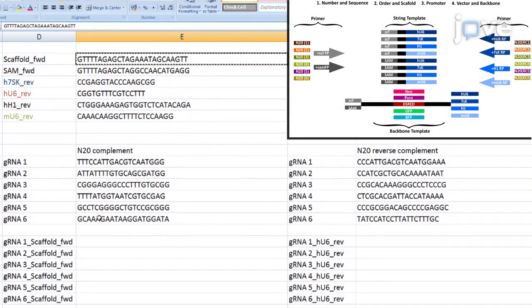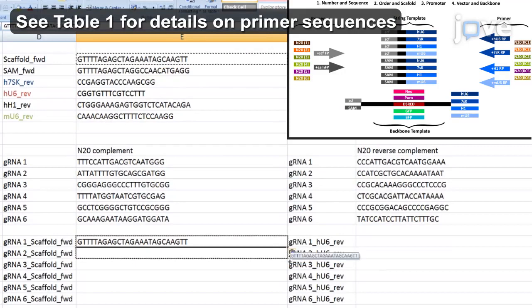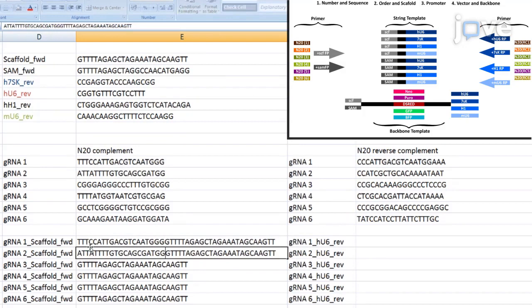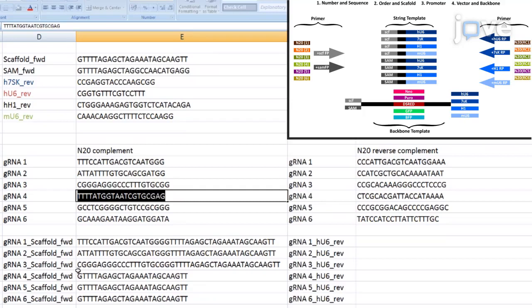To begin, add the n20 gRNA sequences to the forward amplification primers for staggered DNA string as overhangs. Add sense gRNA sequences 5' to the forward primer scaffold forward primer for a conventional scaffold, or to SAM forward primer for an MS2 containing scaffold.